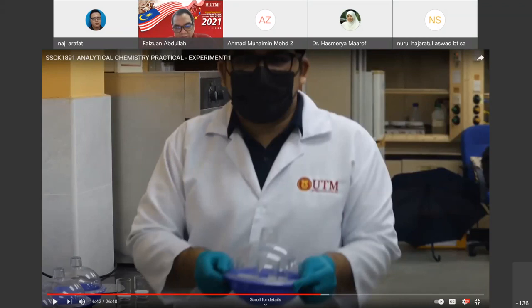In fact, it contains nothing yet. It just heated, and after heated, I put it in the desiccator. If you didn't hear or didn't use the desiccator before this, it is a closed container that contains silica gel at the bottom of the desiccator. So from your idea, what is the purpose of using the desiccator?